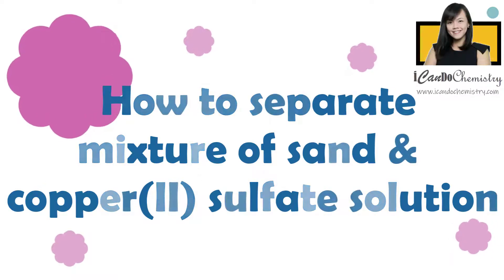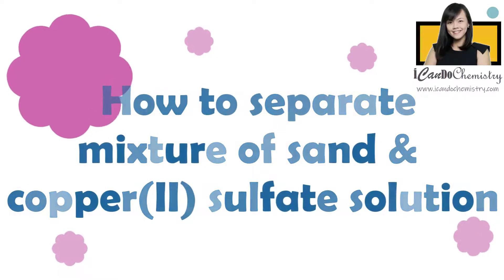In this video, we will focus on how we can obtain sand and pure copper-2-sulfate salts from a mixture of sand and copper-2-sulfate solution.